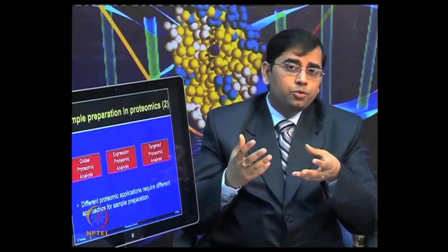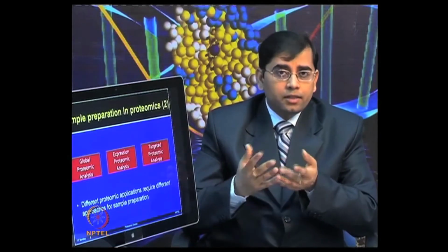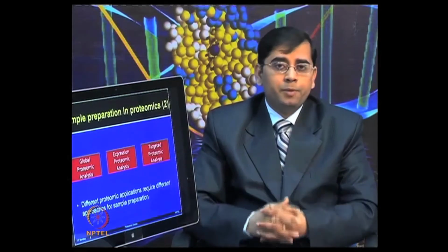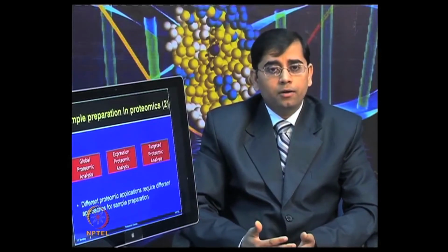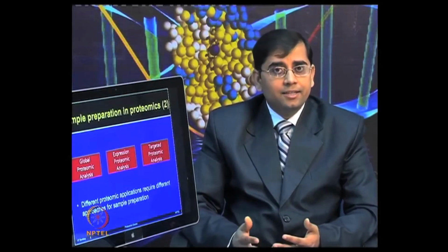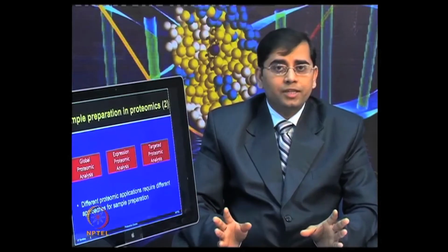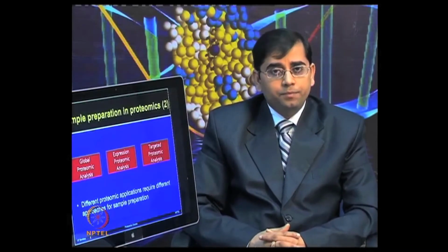So, one needs to try different types of strategies when thinking about performing sample preparation. What is your objective? Whether you want to do global profiling or expression profiling, in either case you need to extract all the proteins present in that particular target sample.